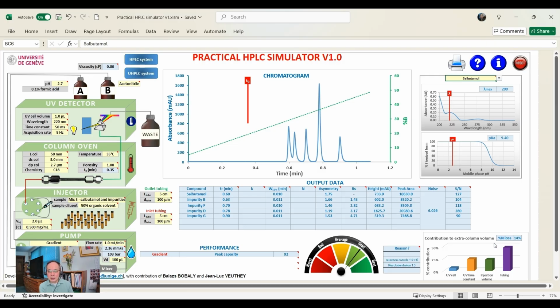So this entire simulation is very well done and very realistic of what you truly get. And they're saying that we are losing a little bit, about 15%, which is not bad, but we can definitely look at these graphs here and try to improve it. We show that by looking at smaller tubing ID connection, we can make this a little better. So let's do some simulation and see what we got, right?